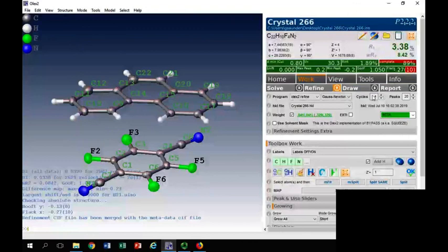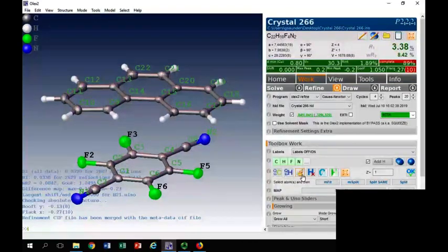Okay, so if you've got wrong assignments, if you've assigned something as a chlorine and it should be a fluorine, it'll tell you. Another way of handling that is by using this brush thing here. It cleans things up. If you've got the wrong atom, and it's only if it's horribly wrong, it will change it to the right one, or one that is closer to the atom. So if you think it's platinum and it's actually fluorine, it will correct it to something that looks nearer to fluorine.